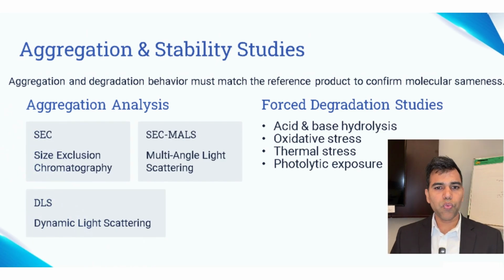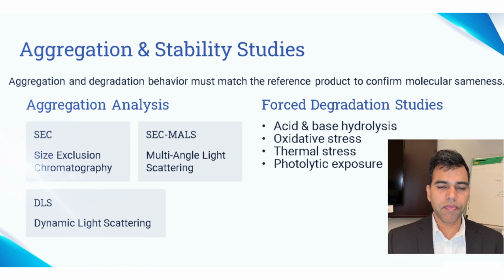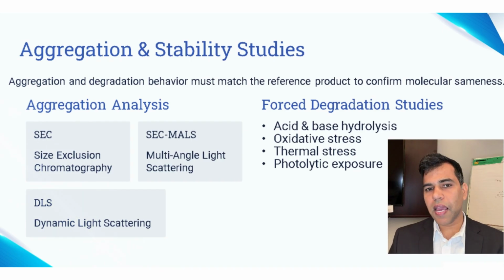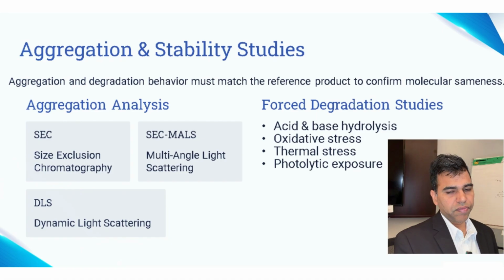Here is a question worth sitting with. What happens to your peptide under stress? Aggregation and stability studies are the part of sameness testing that looks forward. They are asking, does this molecule behave the same as the reference, not just today but under challenging conditions?